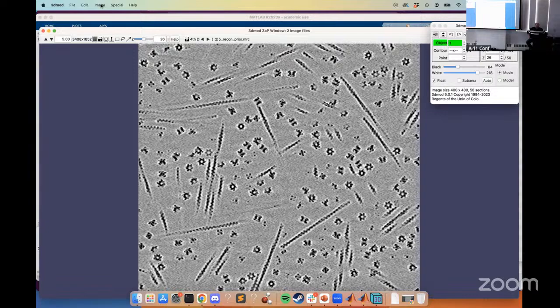And so you can integrate Dragonfly segmentations into a particle picking pipeline. We've done that for sure. It's a little bit of a pain, but this is probably true of all particle picking. Particles are too close together, they seem to stick together and you get these weird clusters of particles, but there are ways to use watershed inside Dragonfly to try to extract the central coordinates of all those particles.